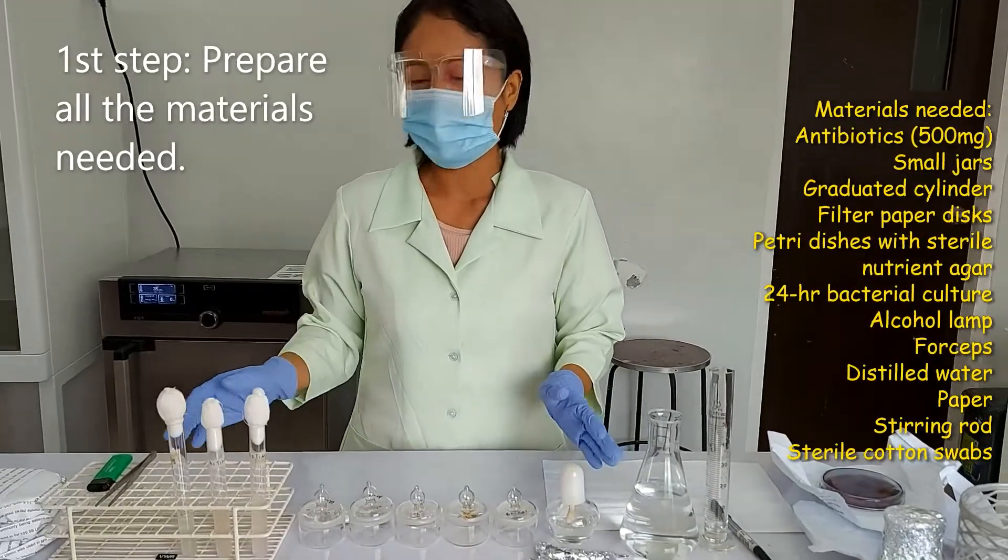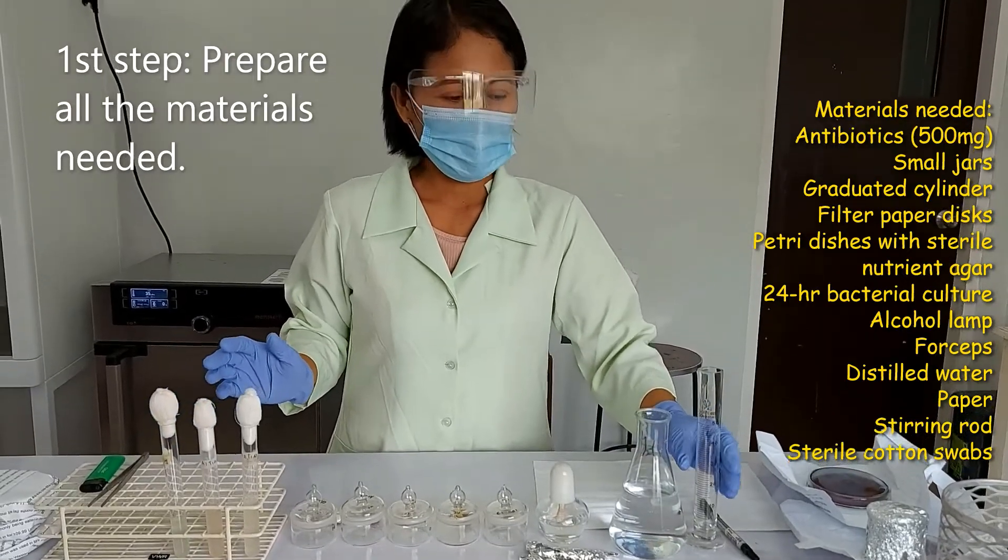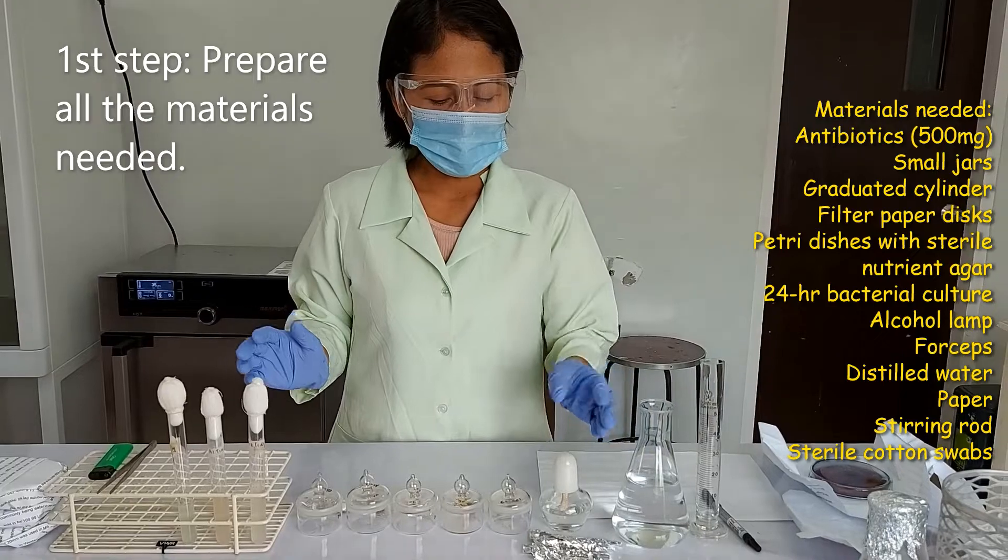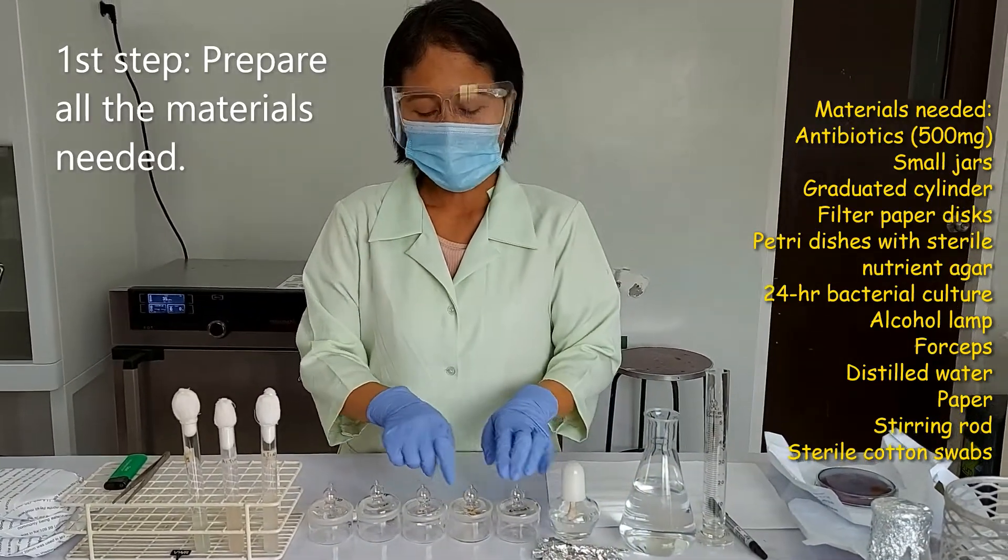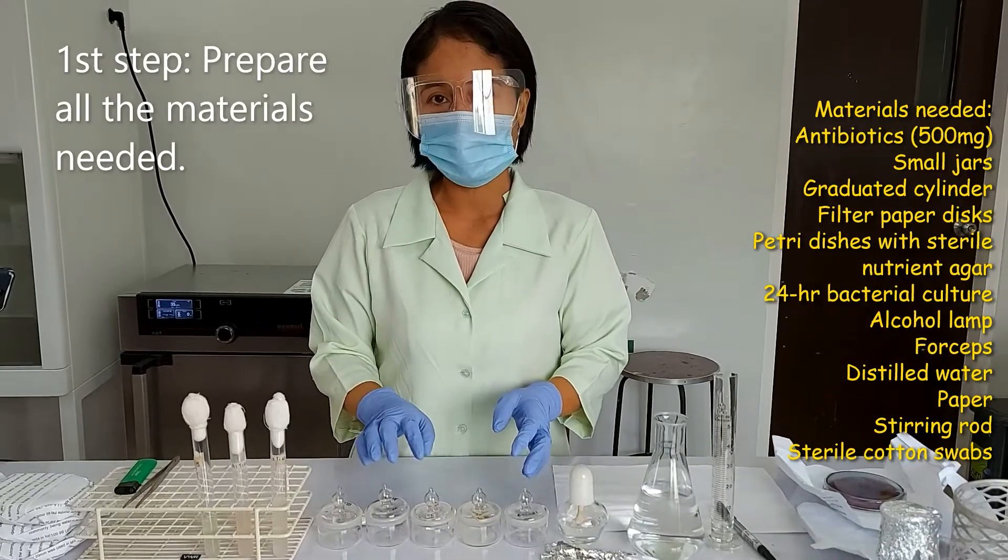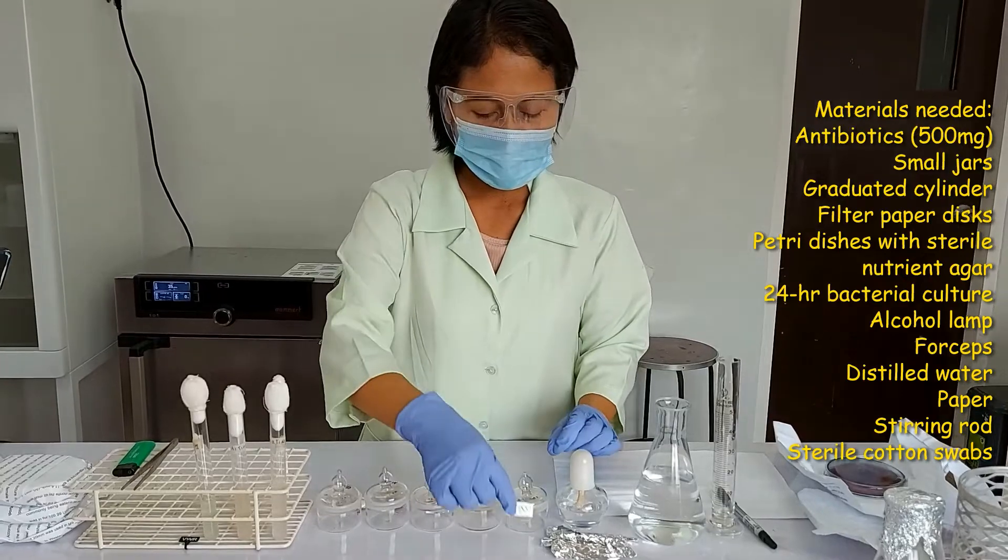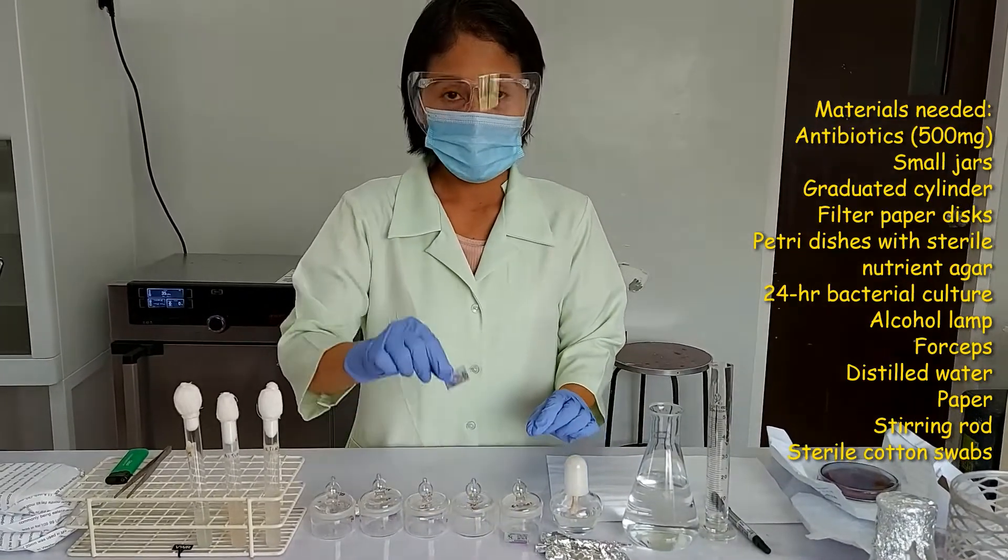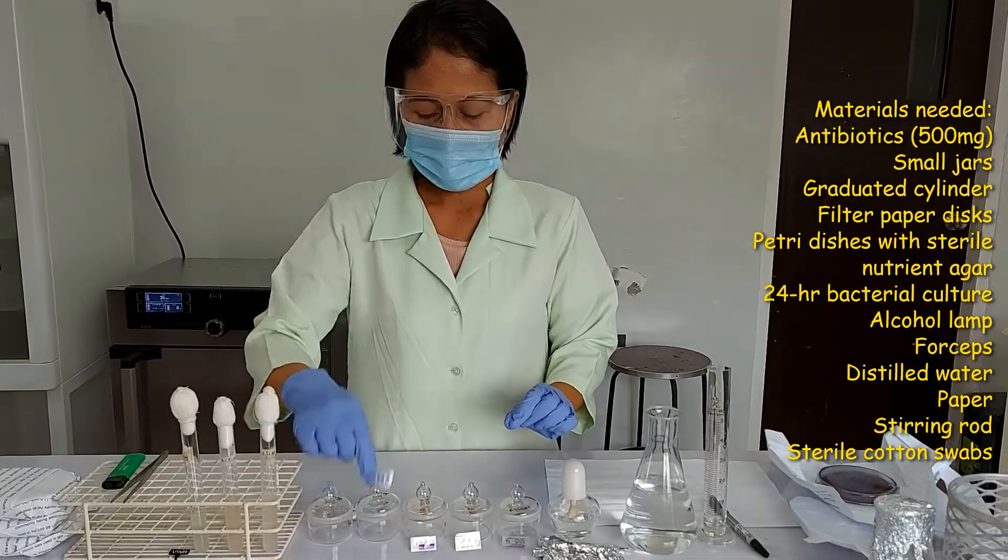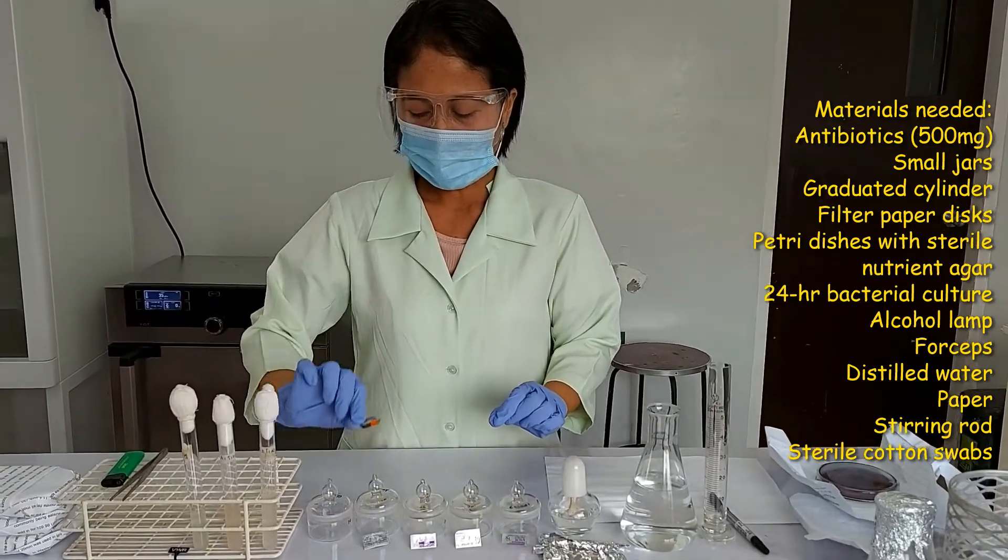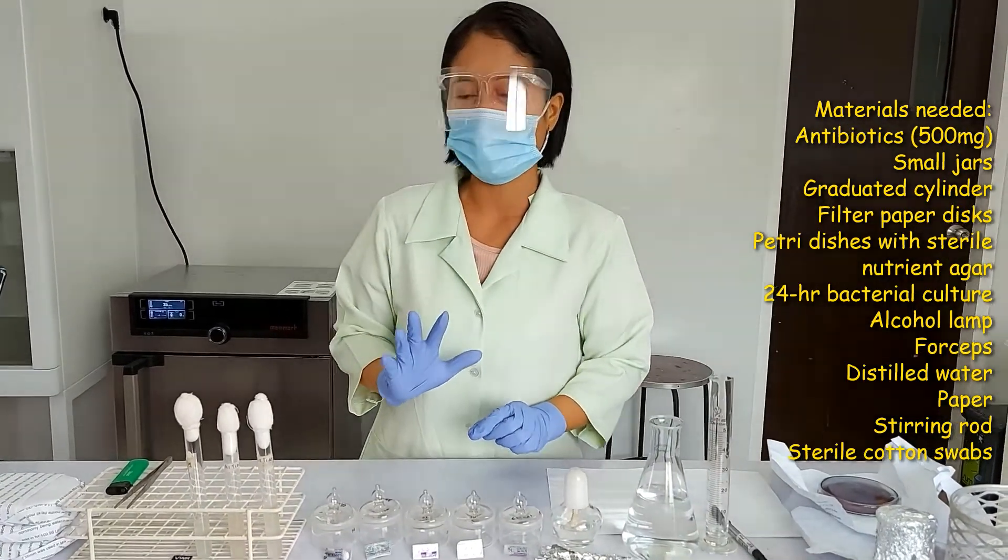These are the things that we need. I have in here the graduated cylinder, distilled water, an alcohol lamp, cotton swabs, the small jars for our antibiotics, and the antibiotics that we are going to test. We have here the clindamycin, cotrimoxazole, cefalexin, amoxicillin, and cloxacillin. So we are going to test today 5 antibiotics.